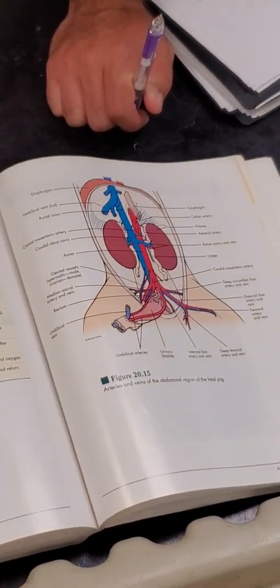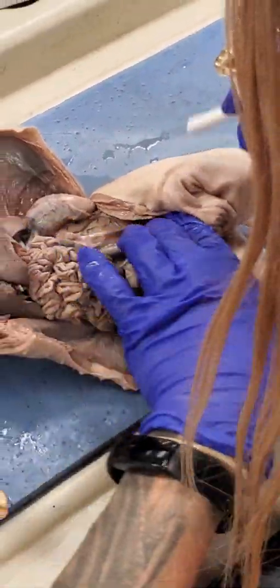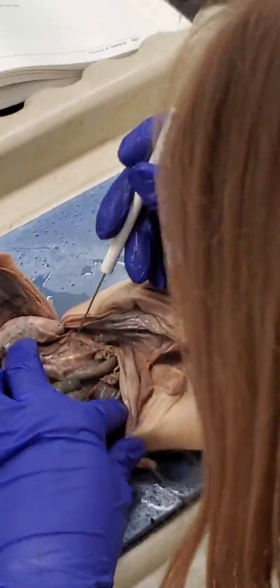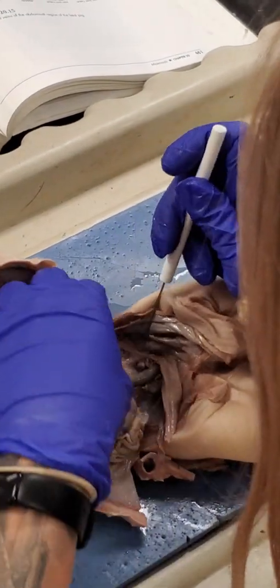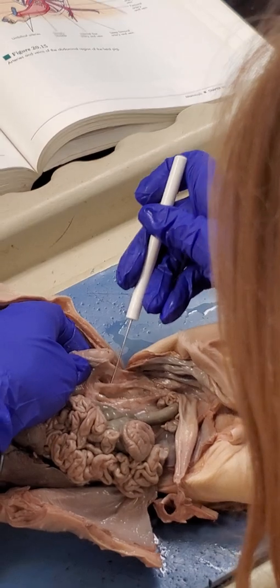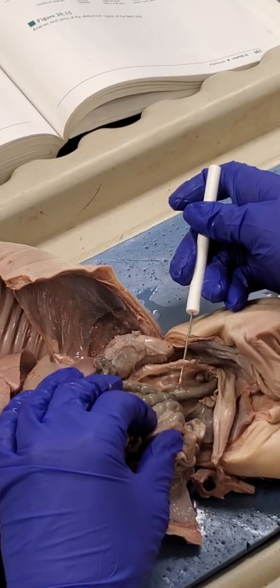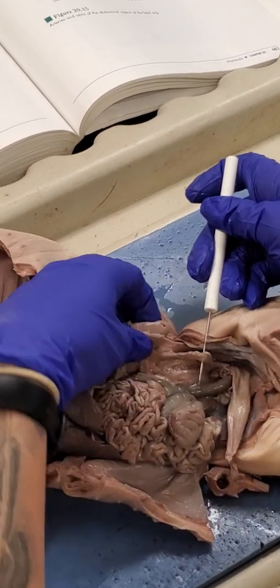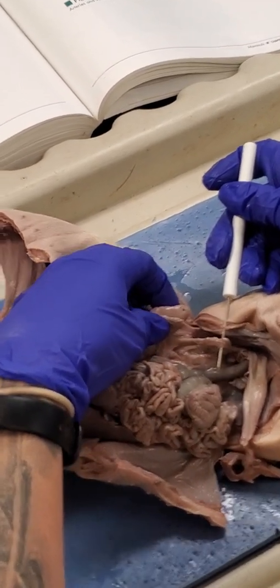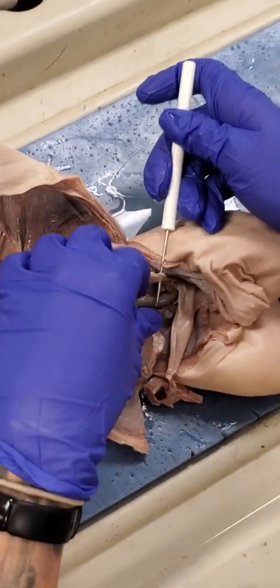Oh, right, that's right. So it connects from the kidney, and I believe that it's this white tube right here. Or, oh, here we go, this thing. So you guys see this thing. There we go, I separated it last time. So we've got our ureter. It's going to be this tube that goes from the kidney. And again, that brings filtered nitrogenous waste into the bladder.